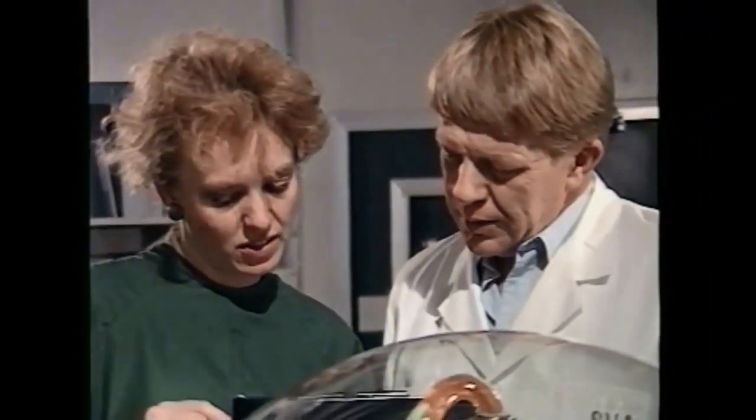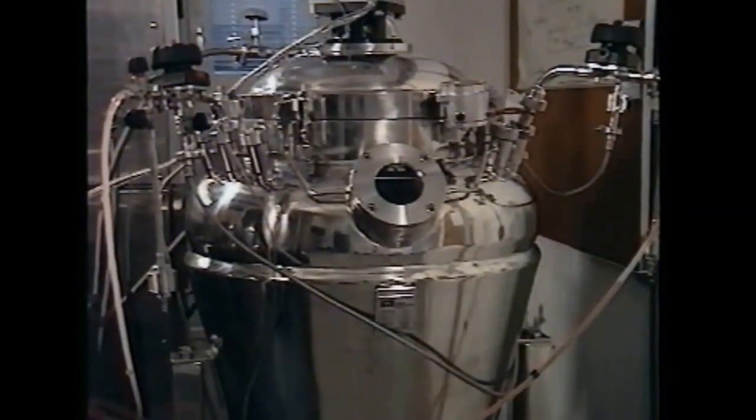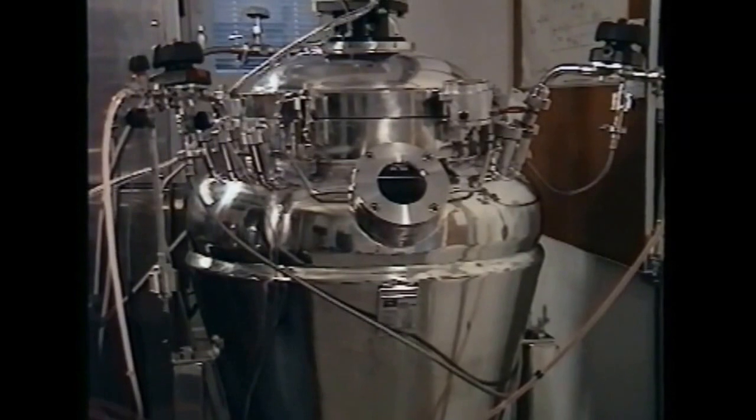Mammalian cells are cultivated in fermenters, either in batch or continuous mode. Usually in a batch process, after the cells have been grown in the fermenter, they need to be separated from the medium.